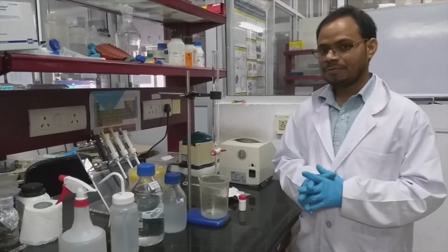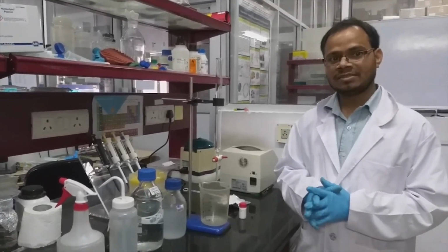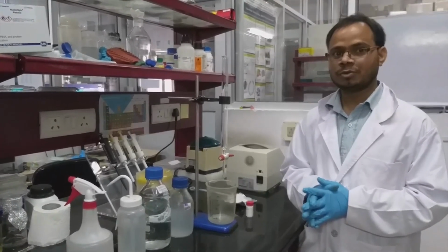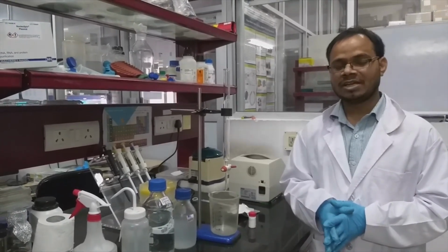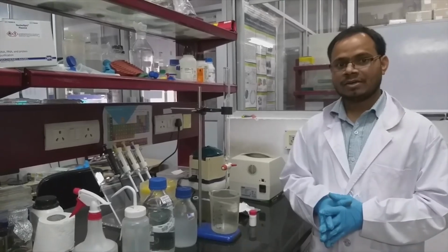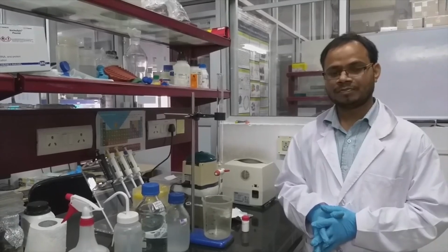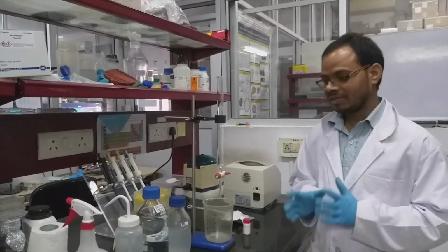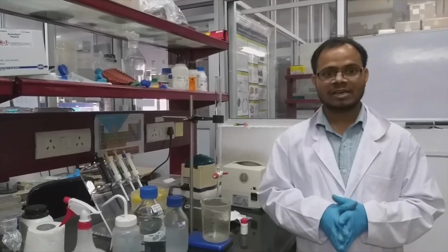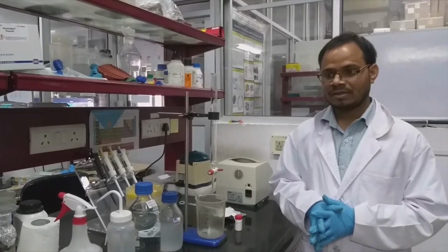For example, if you want to separate based on size or shape, gel filtration chromatography suits the most. If you want to separate molecules based on their charge, then you can go for ion exchange chromatography. But in this video we are mainly focusing on gel filtration or size exclusion chromatography.